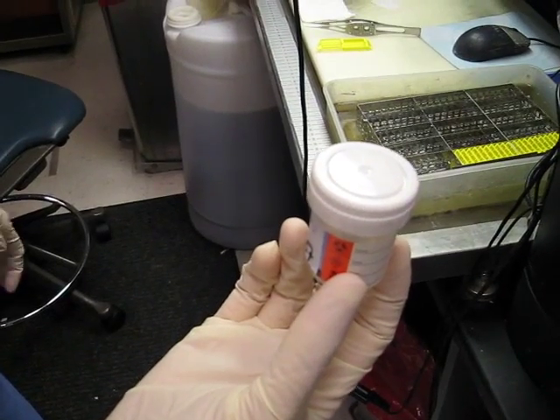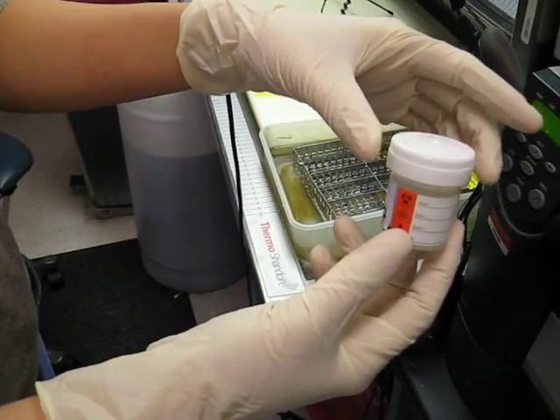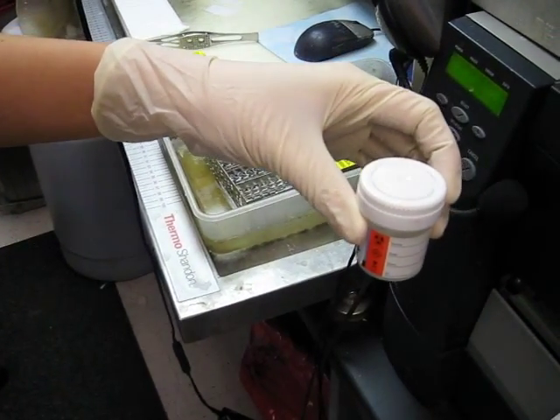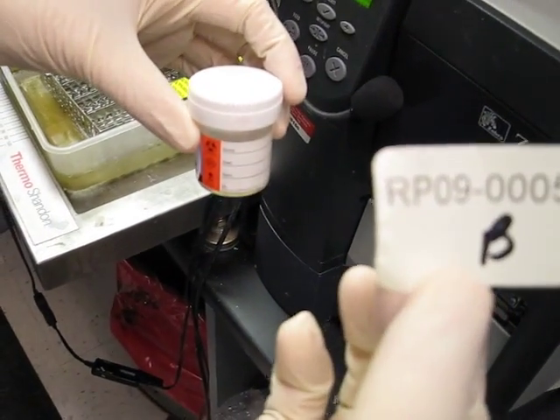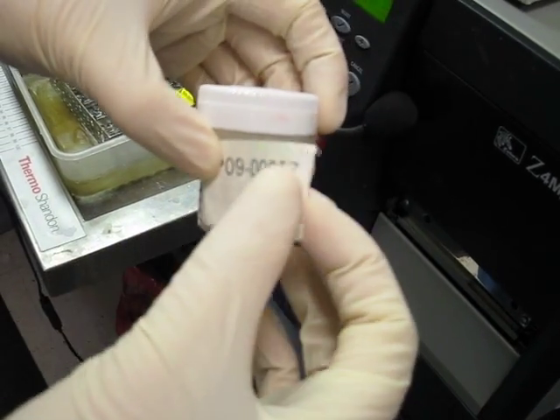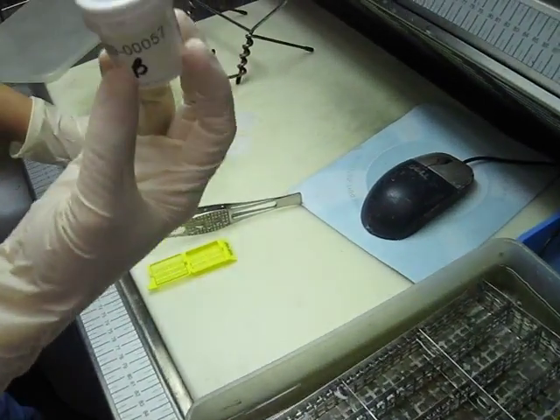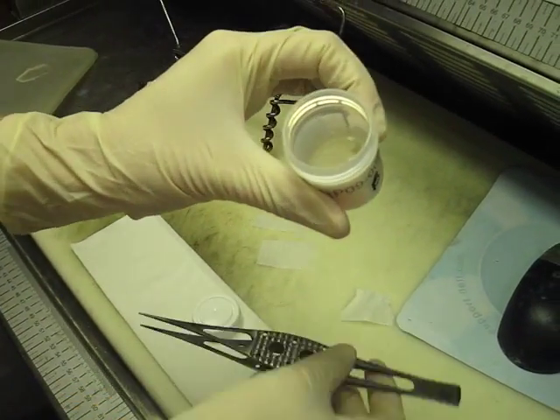Okay. So when we receive the specimen, it comes in a plastic bottle like this, and we bring it to someone to be accessioned, so they will grid it into the hospital system, assigning it to the particular patient that it came from. So this is an accession sticker that we will stick on the specimen, and it identifies permanently who the specimen belongs to. So after we receive the specimen, we open it and take a look at the specimen inside.